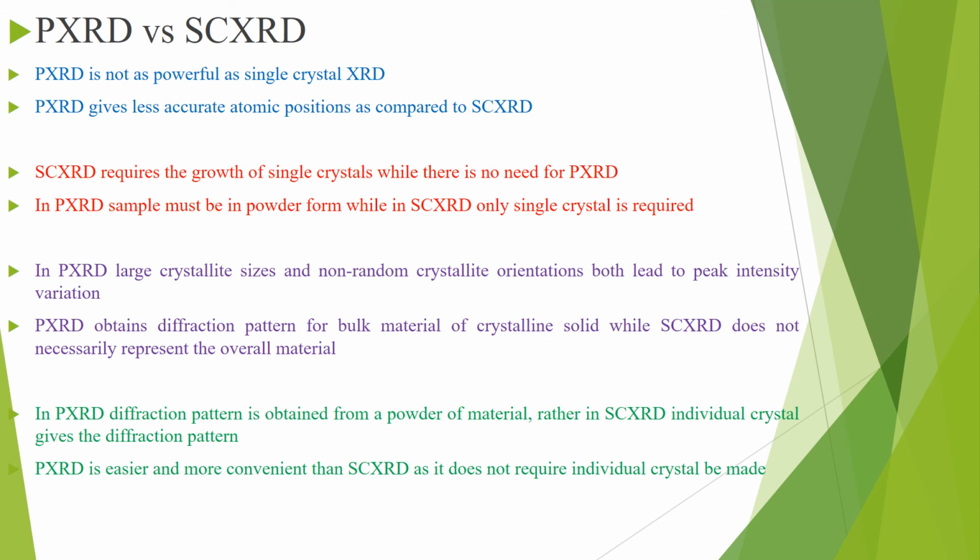As we know, powder X-ray diffraction is not as powerful as single crystal X-ray diffraction technique. And powder X-ray diffraction gives less accurate atomic positions as compared to SCXRD.